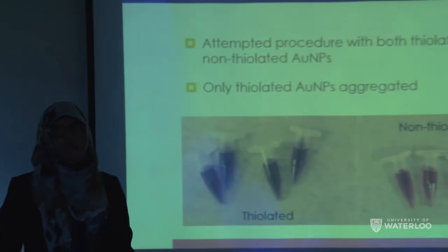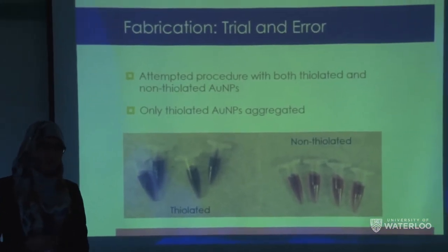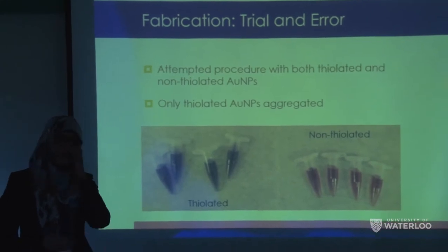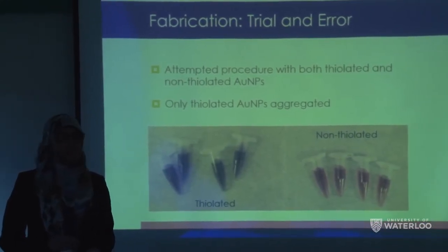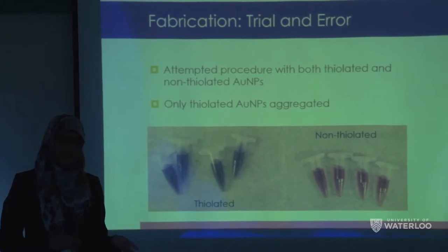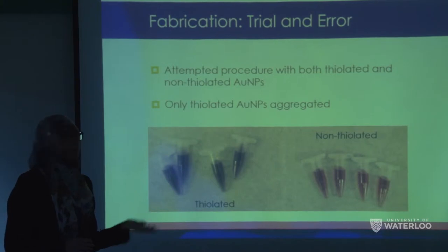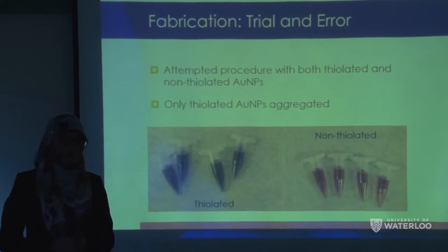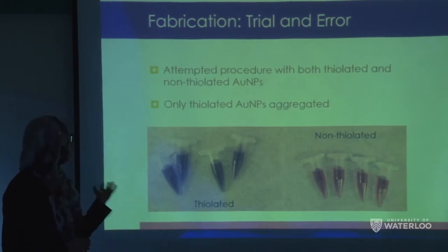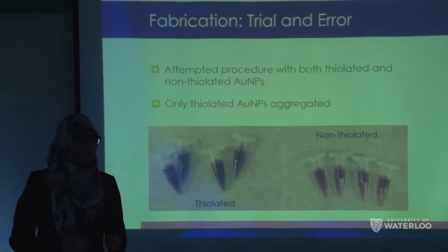We also attempted different experiments with thiolated and non-thiolated gold nanoparticles themselves. We wanted to try using gold nanoparticles that were not thiolated because this would help reduce cost and it was easy to obtain. However, we saw that with non-thiolated gold nanoparticles, there wasn't even any aggregation after our incubation time. So again, the sensor wouldn't work properly if there was no aggregation. With our thiolated gold nanoparticles on the left, you see we have a very deep purple color. Again, we got our aggregates, so we'll be able to use this for our sensor.